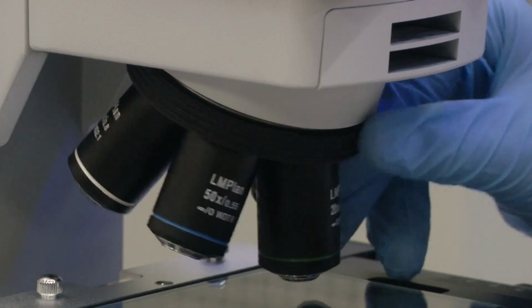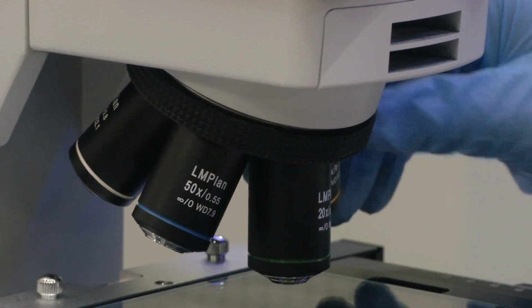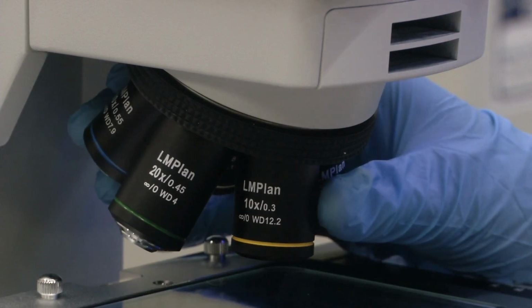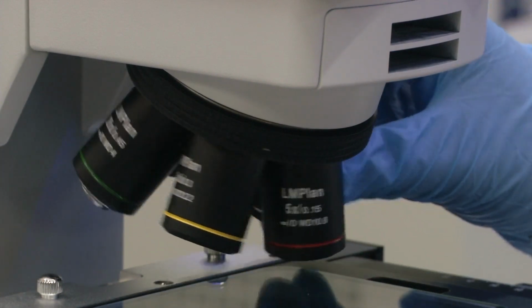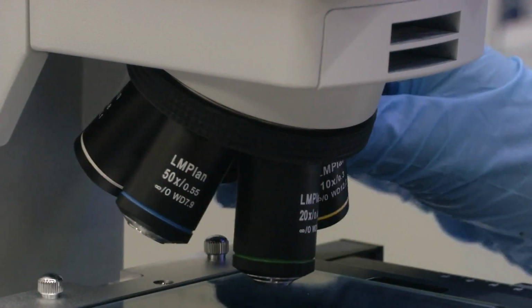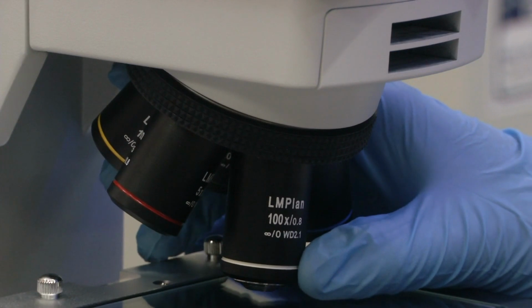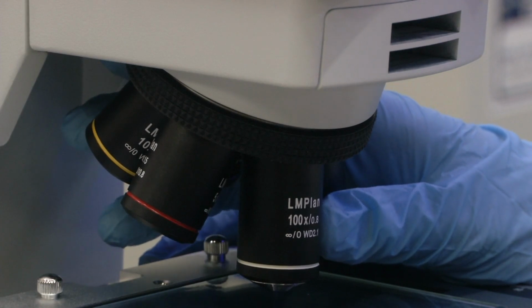So, let me recap. We have this turret which houses all the objective lenses used by the microscope. You can have multiple options, and usually a turret will give at least 5 slots to insert your different objectives. Here in our lab we have inserted 5x which is red in color, 10x which is yellow, 20x which is green, 50x which is blue, and 100x which is white. These colors are only for your easy use during your day to day research life. You need not go and read each lens to know the magnification.